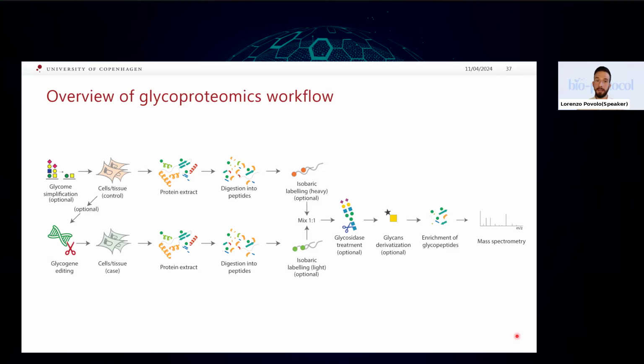Well, if we exclude the genetic engineering part, which can take maybe three months on average in our hands, the actual glycoproteomics sample prep is not that long. I think in a week of daily work, you would get a sample ready for mass spectrometry analysis. Then afterwards there is the analysis part. The run per se is relatively quick. Because there are some overnight incubations here and there, a week sounds feasible.